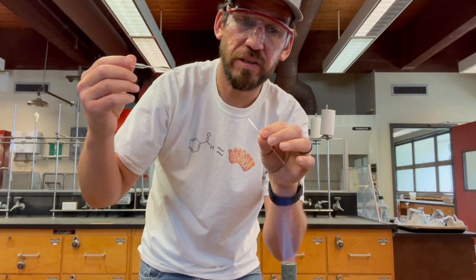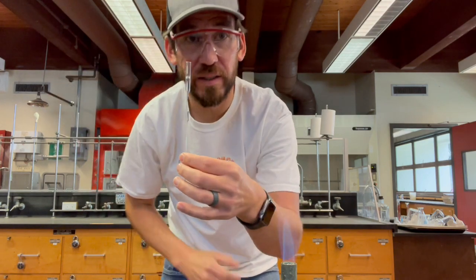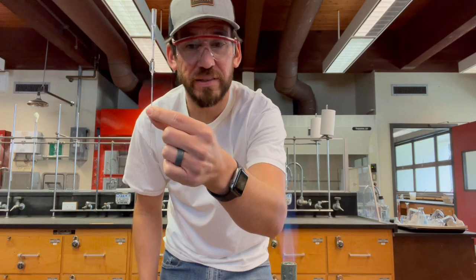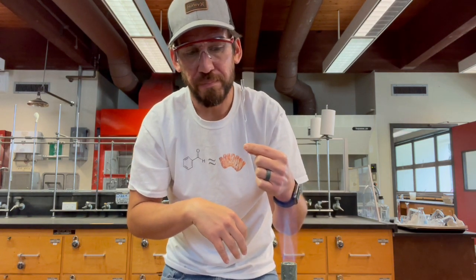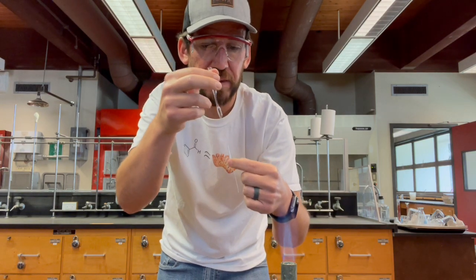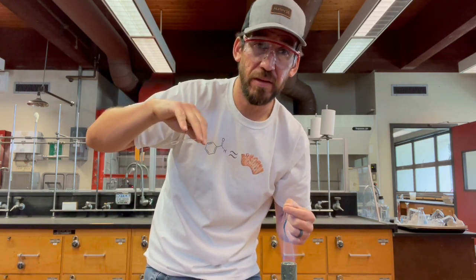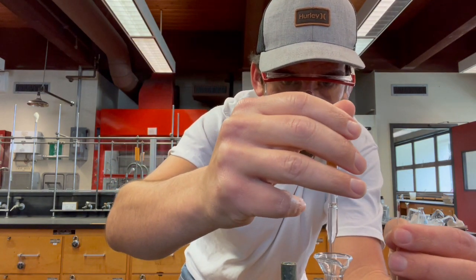That's what you want to do just to check, see, my eyes are still good. You make sure that it fits inside. You also want to make sure that it fits kind of far down, because sometimes when you have viscous liquids and you want to put them in here to try this method, they get stuck up here, right? You want them to go all the way down to the bottom of the capillary tube, and then you want to place your micro bell in there, and if it doesn't go all the way down, then we're going to centrifuge it to push it down. Okay, and I'll show you the final product, because you might as well watch me. Don't believe me, just watch. Right? I'm not fudging this stuff.